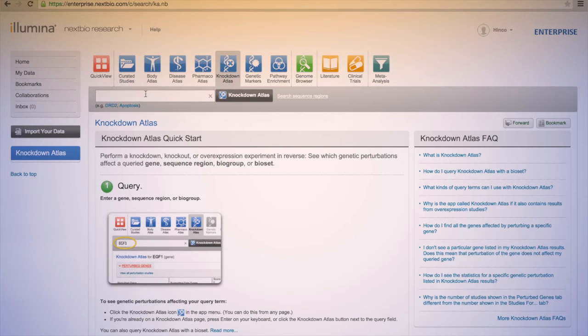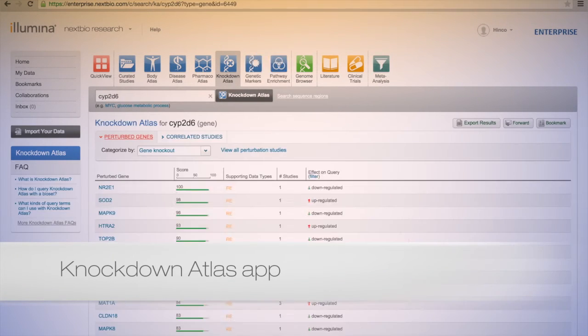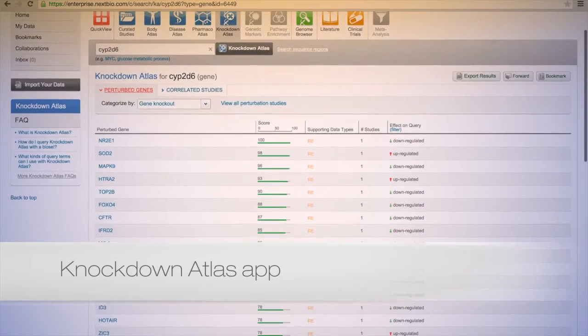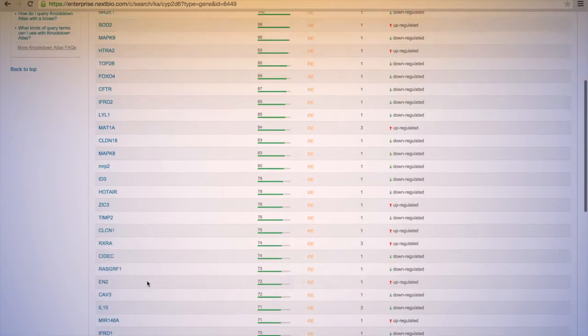Identify gene expression alterations with the Knockdown Atlas app. See which perturbations affect a gene and how.